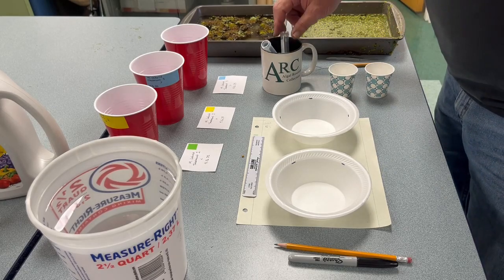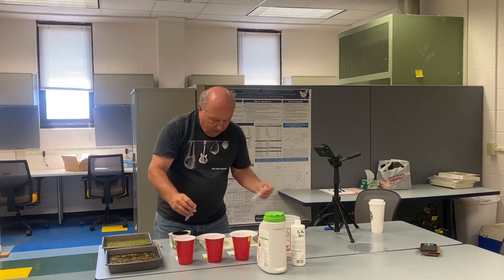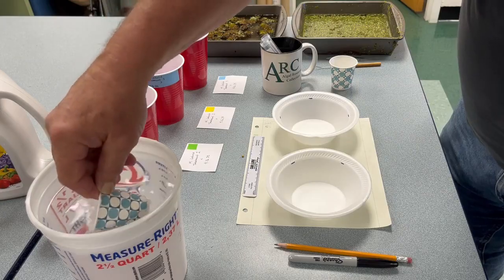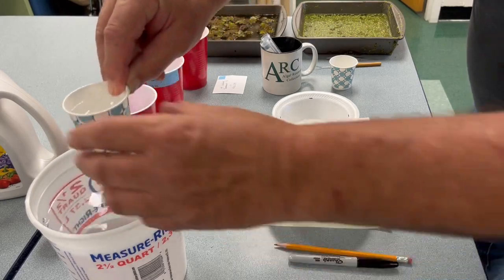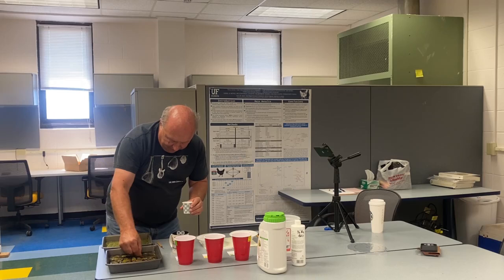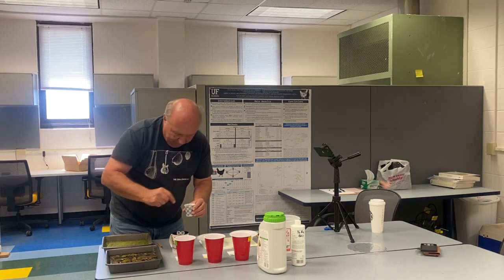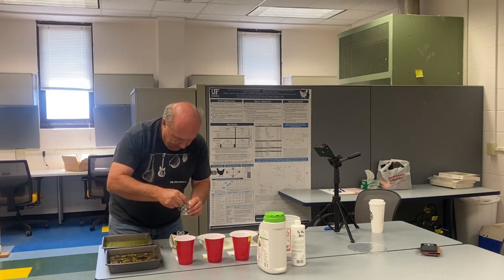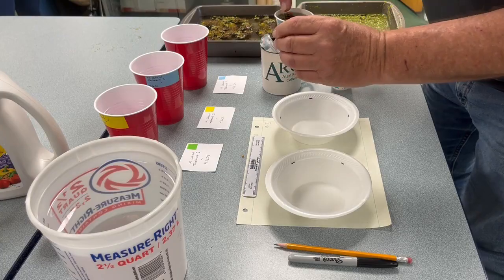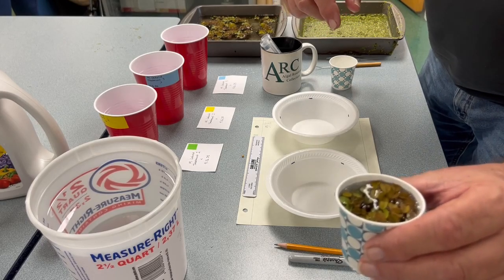Okay, so in order to do that, we use these pre-selected containers that we will call low and high. And so the way this works is we get a little bit of water and get it quite close to the top. And I'm gonna start putting Salvinia in here. This is the Salvinia, the bigger one, and putting it out in here. I find that it's most useful to use your fingers, even though technically you could use some implement of some sort or another. And we're shooting to get 100% cover of the Salvinia.